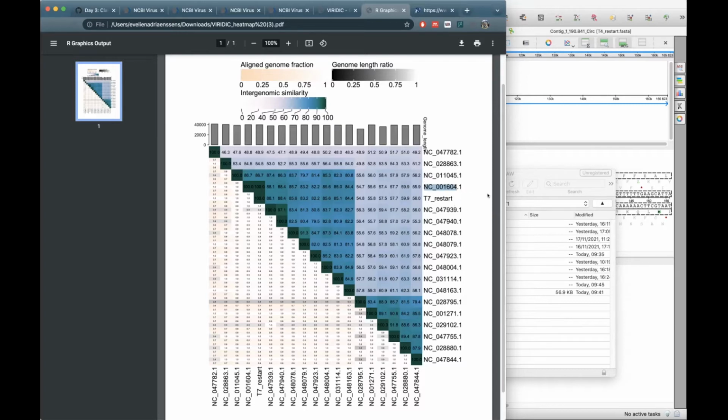But then we can see with this section, they're all more than 80%, but so definitely more than 70% similar between their whole genomes. So these represent a genus together, and this should be the T. septimovirus genus, whereas these also belong together. And we can go back to the NCBI virus to see whether they were indeed a new genus or whether I have some work to do.